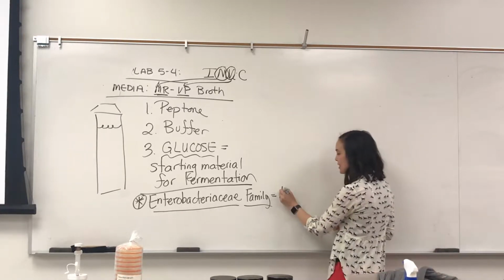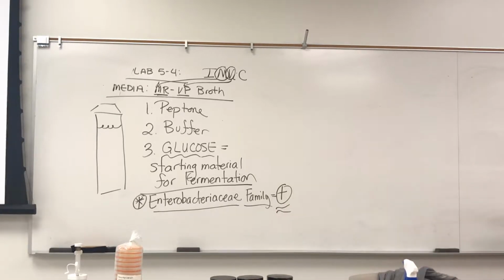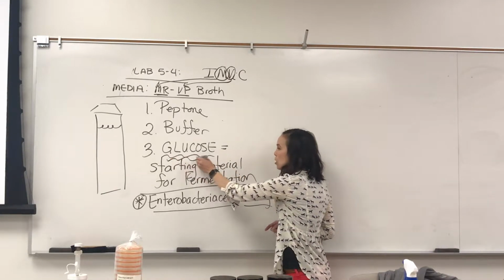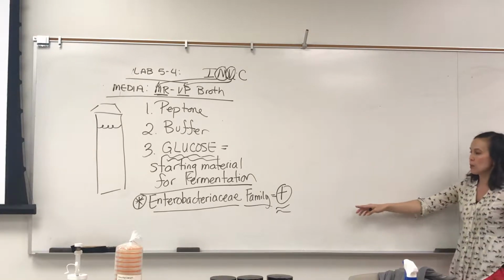Yeah, you're all positive. I just wanted to mention it because it was a long time ago. So if you are in the family, you're going into this expecting something to happen, because we do know that if you're in the family, you tend to love to ferment glucose. Lactose is a different story though. The lactose was like the coliform, so that's kind of different. But glucose is a little bit more universal.